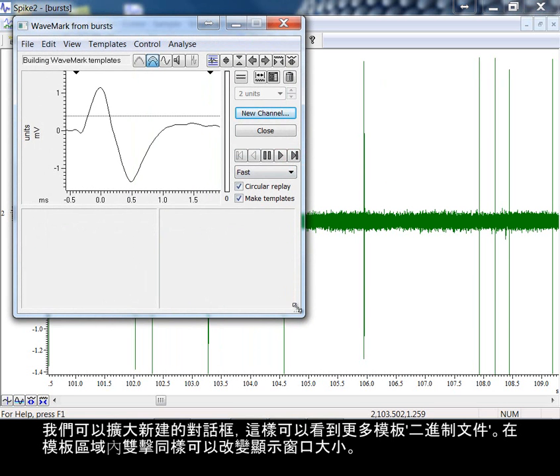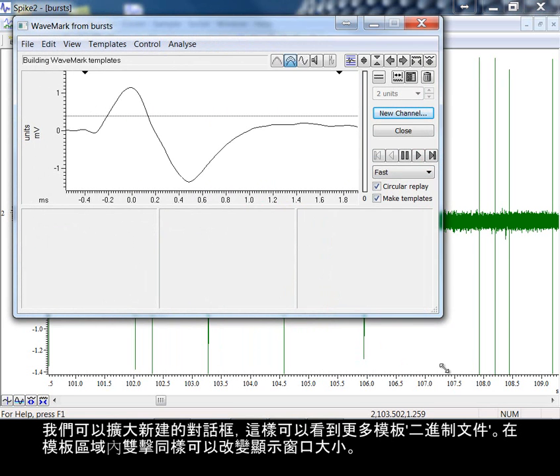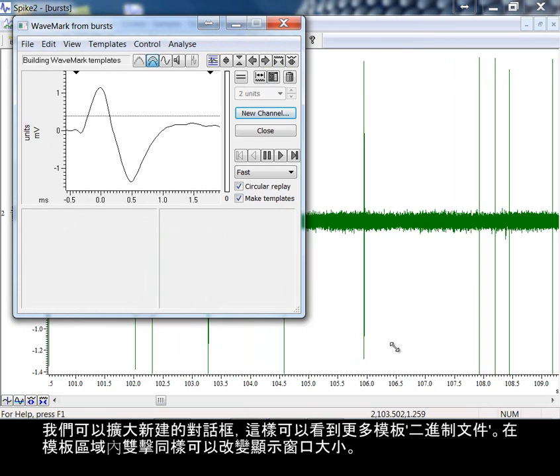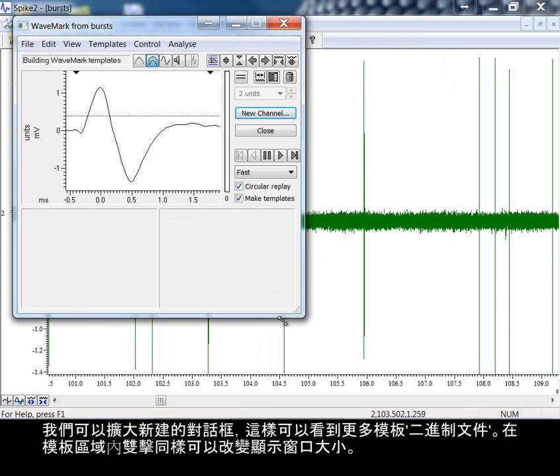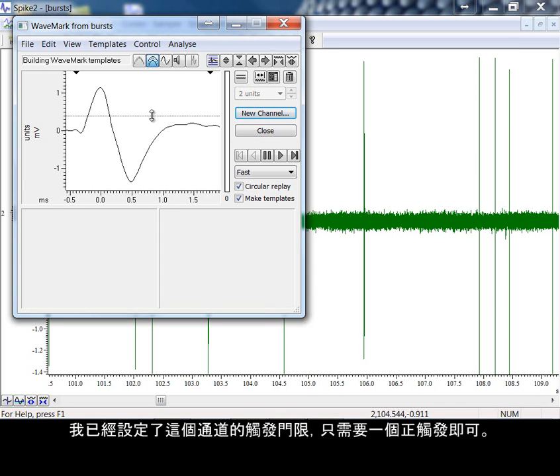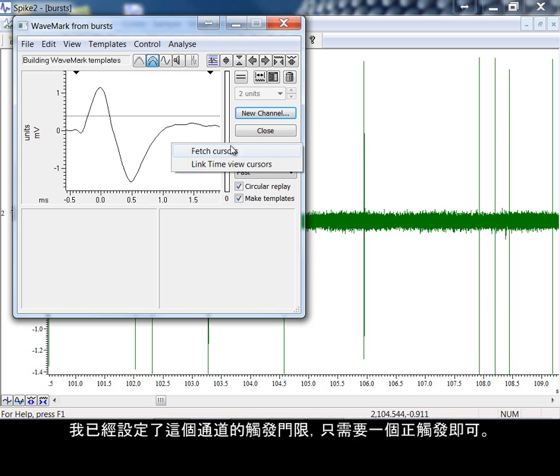We can now resize the new dialog to show more of the template bins. Double-clicking in the template area also resizes the display. I've already set up the trigger thresholds for this channel, deciding that just one positive trigger is necessary.